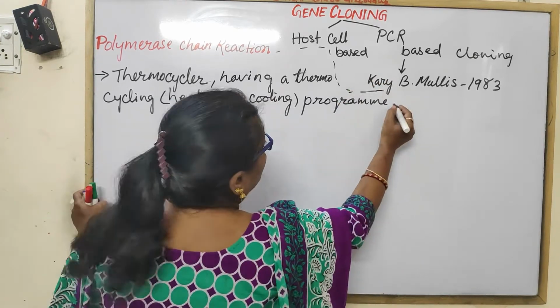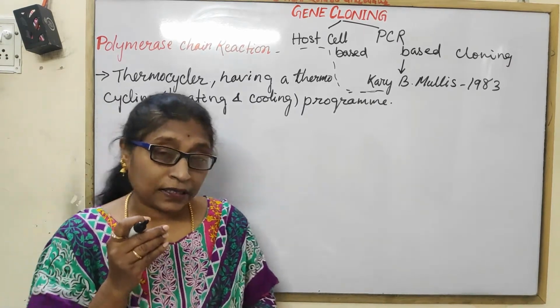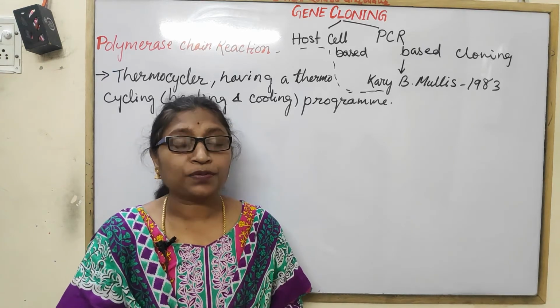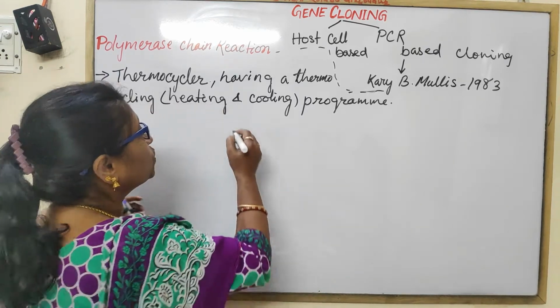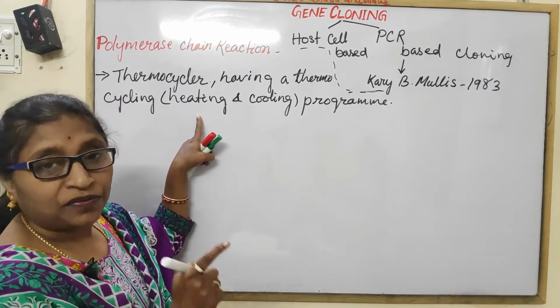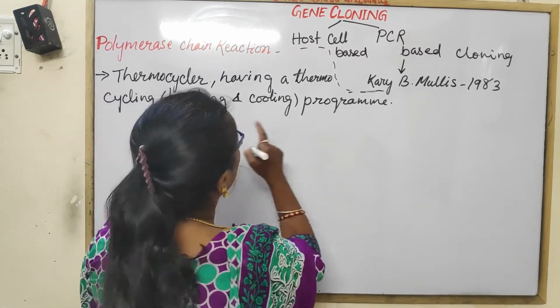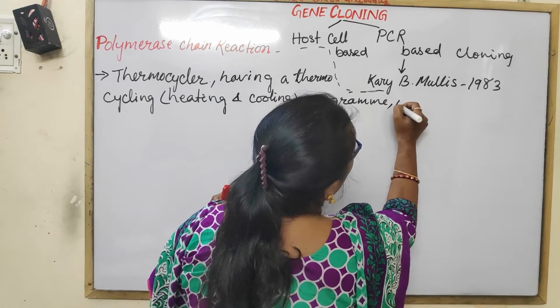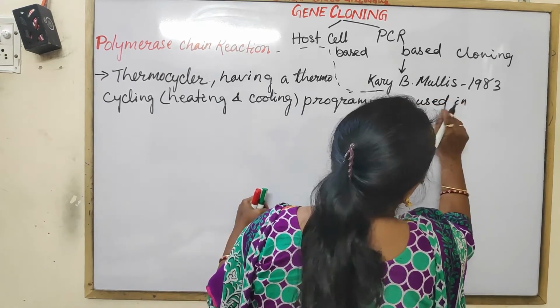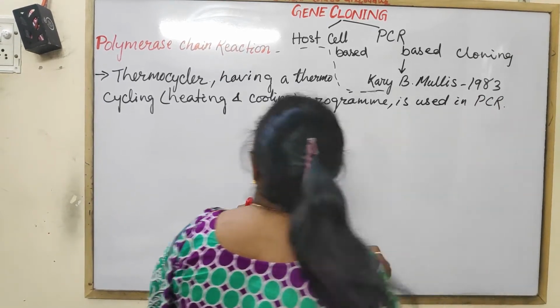Into the thermocycler, the desired gene, the target gene, along with the other substrates, is introduced. So this thermocycler, having a thermocycling program, is used in PCR, polymerase chain reaction.